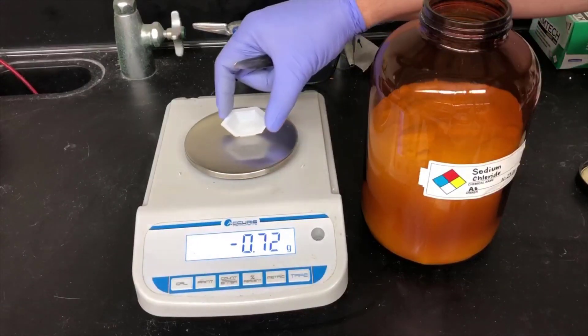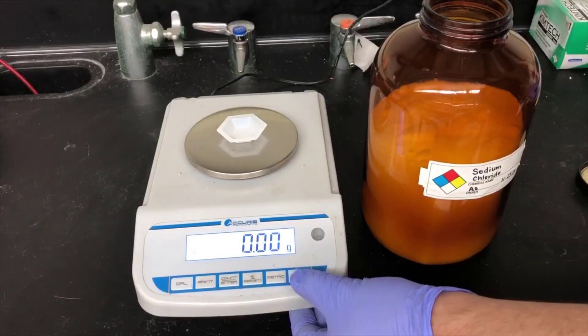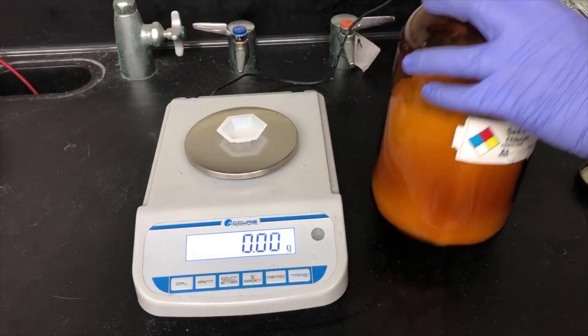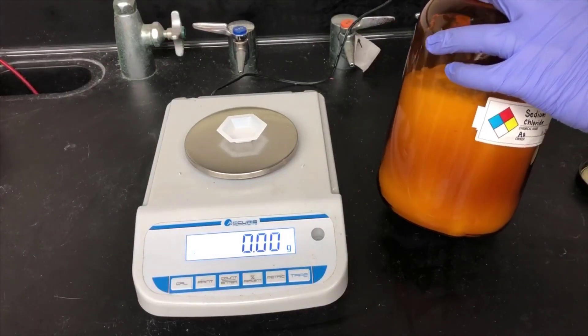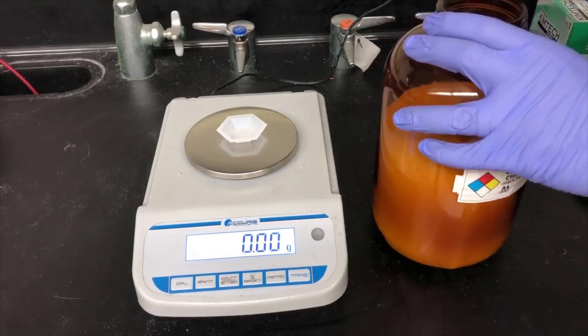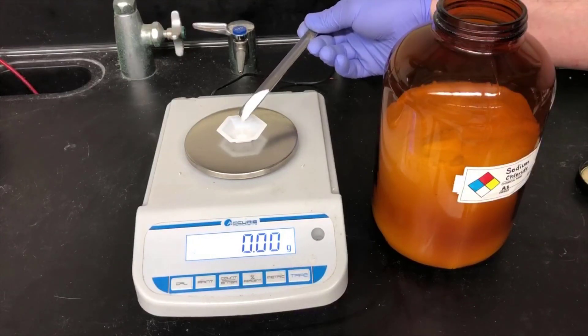Here I'm weighing out 0.5 grams of sodium chloride. That's table salt. I'm going to add this to the distillate, which contains the mixture of water and cyclohexanone.